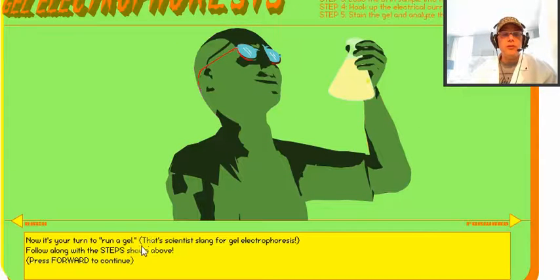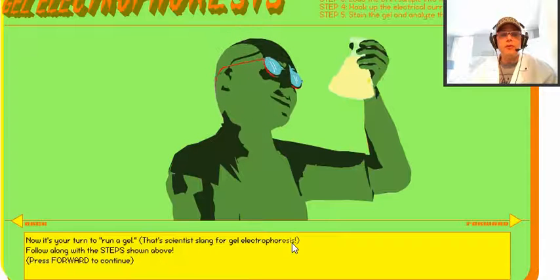Now it's your turn to run the gel. The scientist's slang for gel electrophoresis. Interesting. Yes, it is.